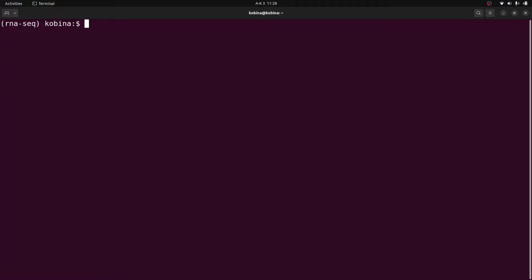Then we are going to proceed. Before we even proceed, we will need to also create a working directory that we will cd into and work in. So I'll just say mkdir RNA-seq. You can name it whichever way is fine, it's just a name. Let's use RNA-seq. So make that RNA-seq, and then I'll cd into it. I'll say cd RNA-seq.